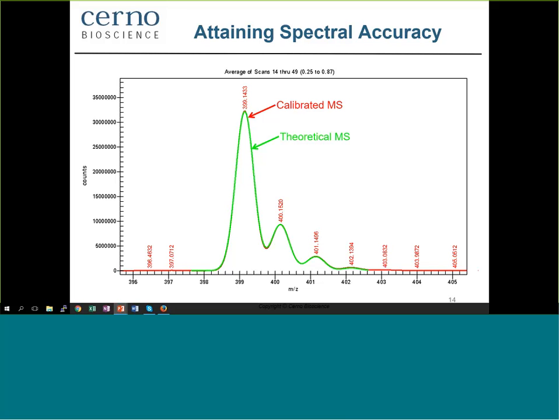This is a very powerful fingerprinting tool, which enables significant improvements for both high and low resolution mass spectrometry, including our ability to perform much more confident formula identification, because not only can we use the mass position, but we can also use the calibrated line shape to get a unique isotope pattern, which can be very accurately measured. It also allows us, even if ions are unresolved, since we know the exact pattern of these isotopes, to deconvolve them, so we can actually resolve mixtures, and we're going to look at that in some of our examples at the end here.